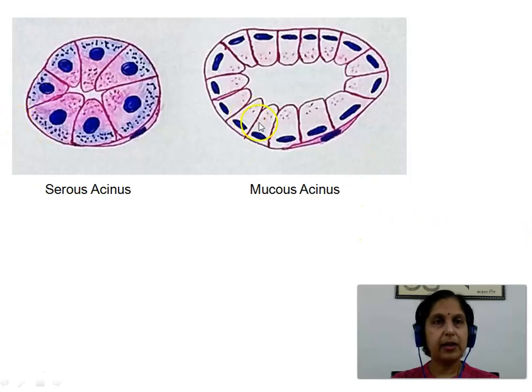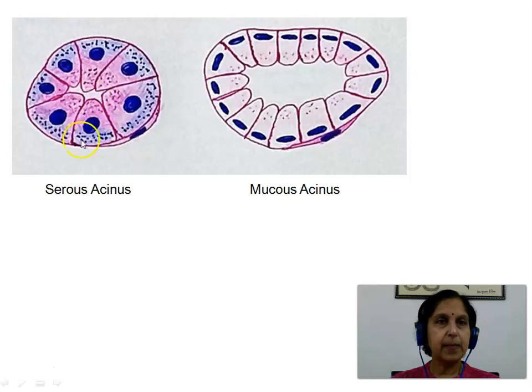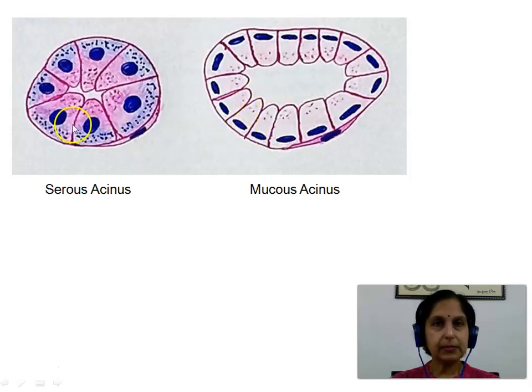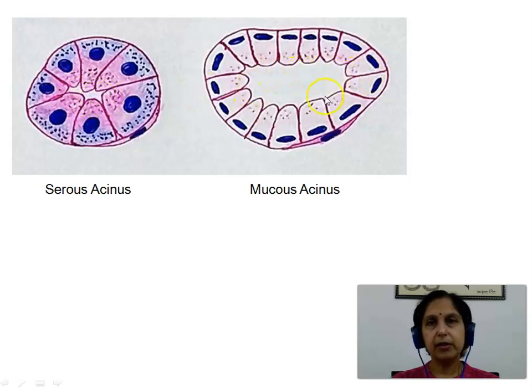Here we see both pictures for a comparative view. The serous acinus is smaller in size compared to the mucous acinus. The serous acinus has large pyramidal columnar lining cells with a rounded nucleus, while the mucous acinus has pyramidal columnar or cuboidal cells with a flat elongated nucleus. The lumen is very small or hardly appreciated in the serous acinus, while the mucous acinus has a well-defined wide lumen.